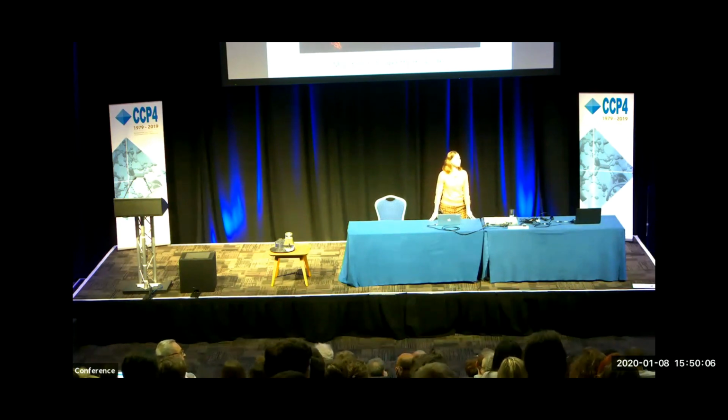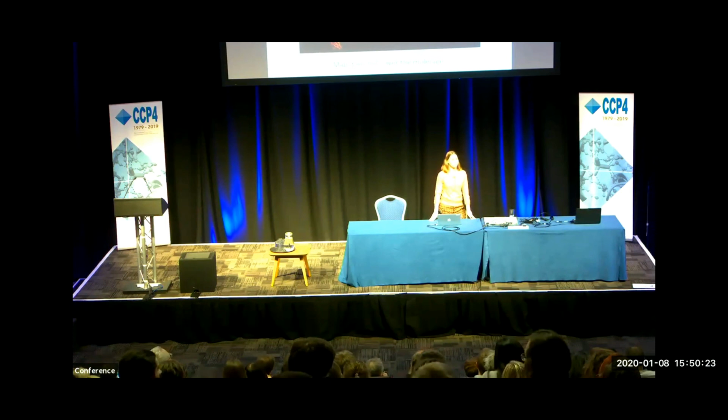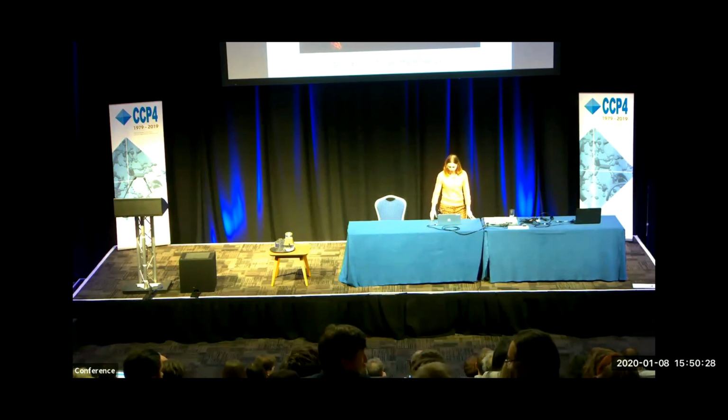Yes, thank you. But I have this question because I saw this all the time from the PDB. So I think using rotamer outliers as a criterion to judge model quality regardless of the resolution is still quite problematic from my point of view. Thank you. Okay, if there are no more questions, let's thank Dorothee once again.